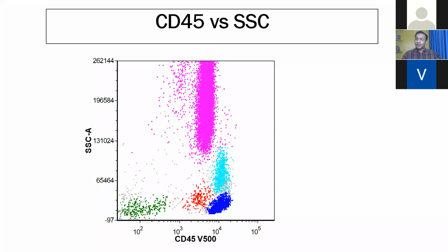There are certain malignancies which are CD45 negative, but for peripheral blood and basic analysis, we have to understand that our analysis approach is first based on side scatter and forward scatter, and next commonly based on CD45 versus side scatter, because CD45 is expressed on all cells, but the intensity of CD45 varies between different cells. For example, CD45 expression is strongest or brightest on lymphocytes and monocytes.